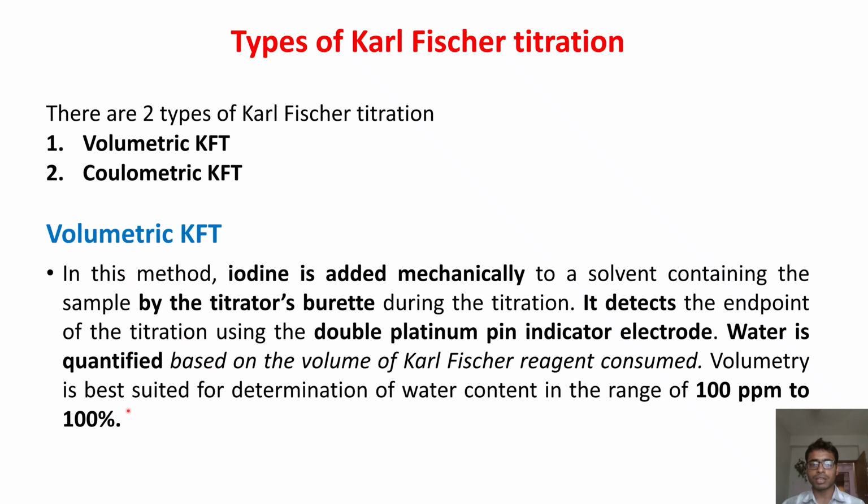Volumetry is best suited for determination of water content in the range of 100 ppm to 100%. So it's for a very large volume of water. But the question may arise: if you have a small quantity of water, then which method should be used? Actually, for a small quantity of water, coulometric KFT is used. So we'll see this now.